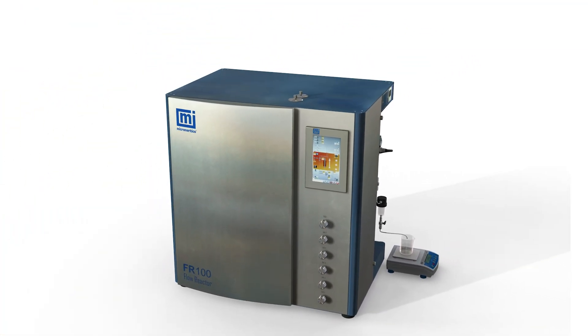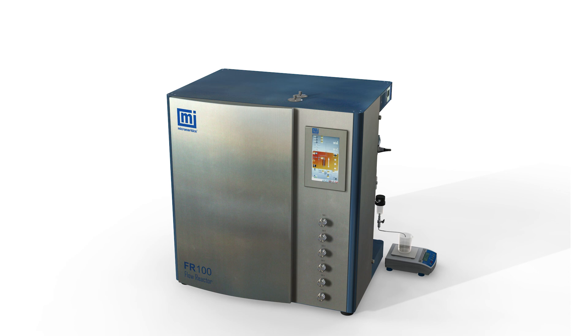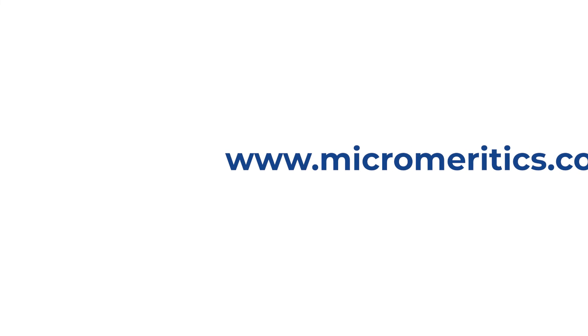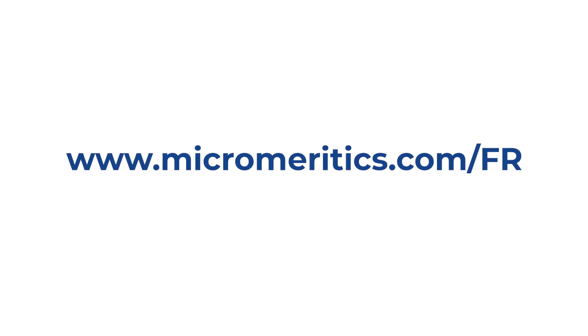The Micromeritics FR100 is a powerful platform for safe and comprehensive catalyst reaction studies. For more information, visit micromeritics.com slash FR.